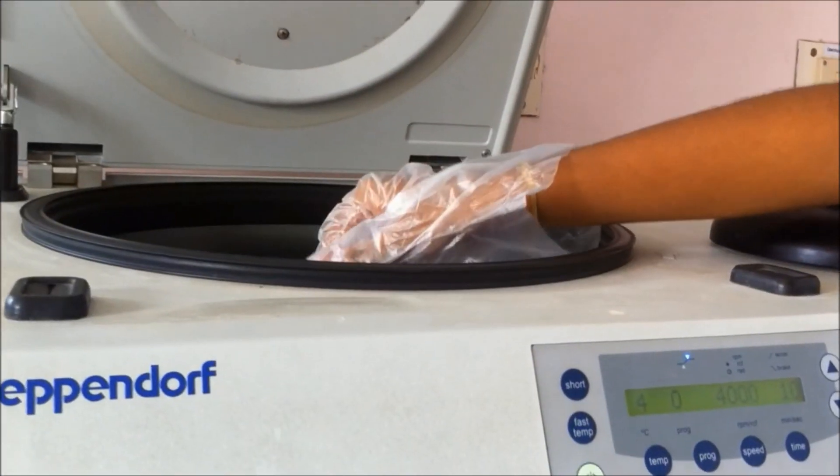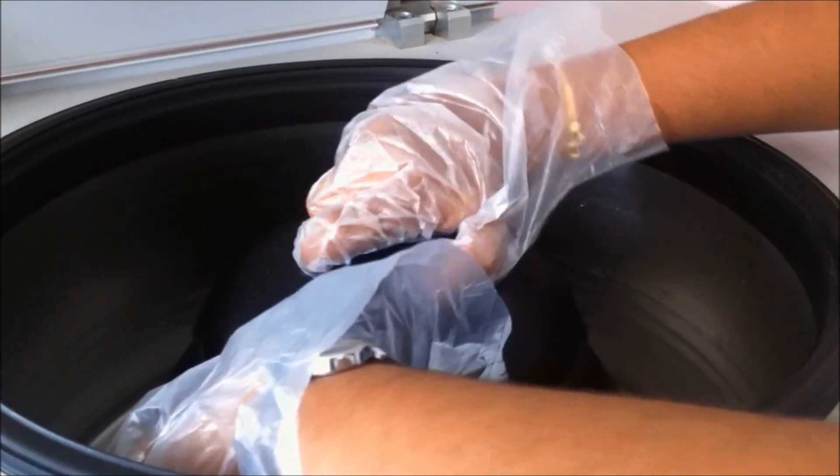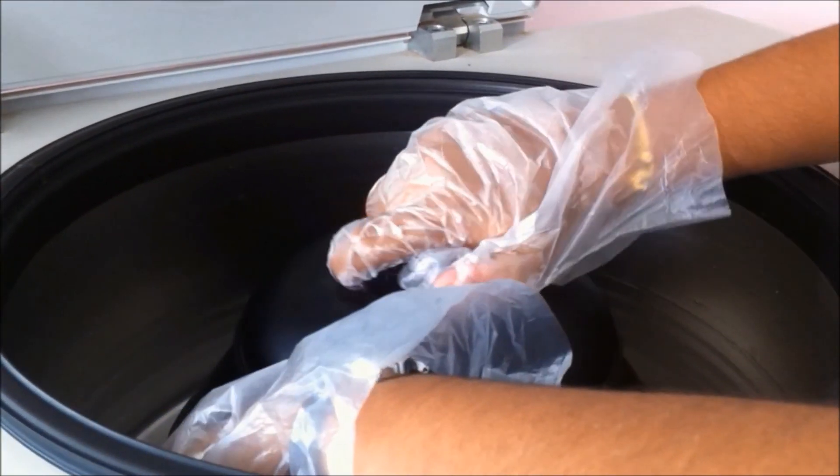Pour the bacterial cells into the microcentrifuge tube or falcon tube. Centrifuge the bacterial cells for 1 minute at 12,000 rpm, whereas in case of falcon tube centrifuge at 4,000 rpm for 3 minutes.